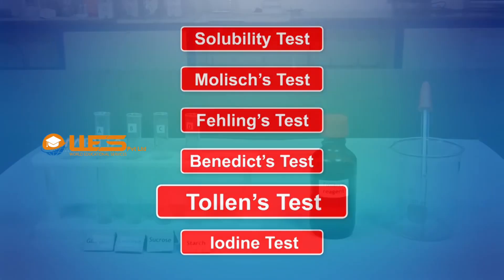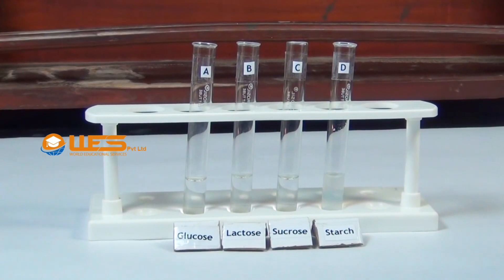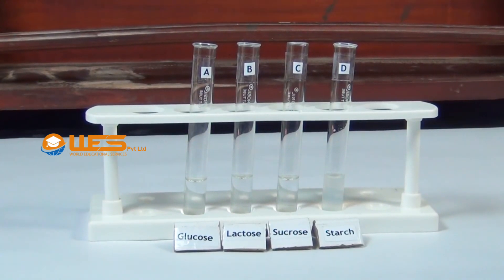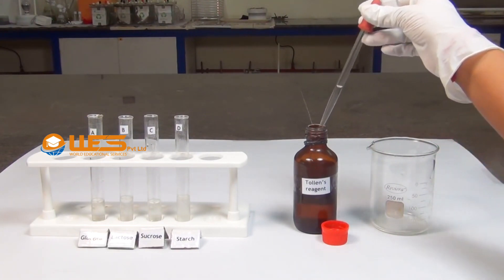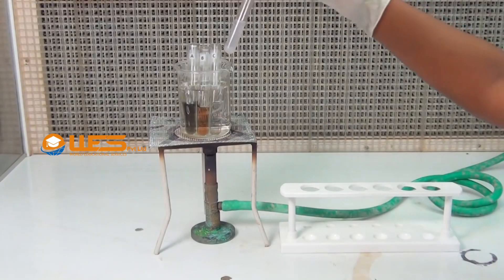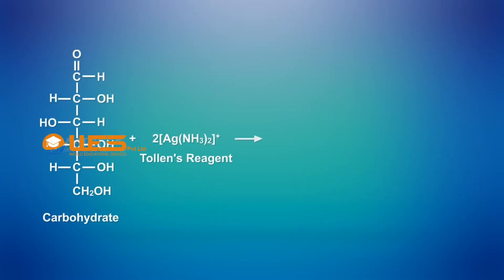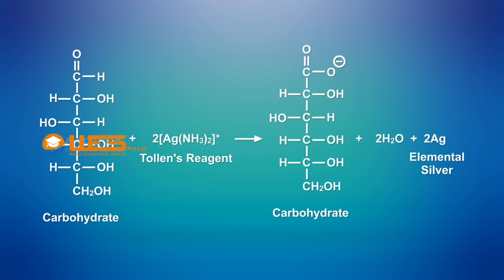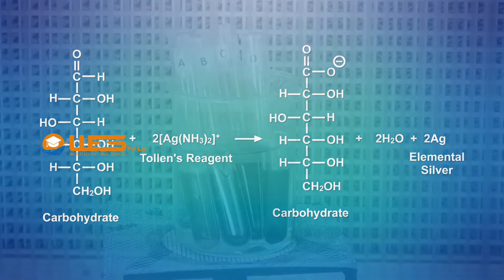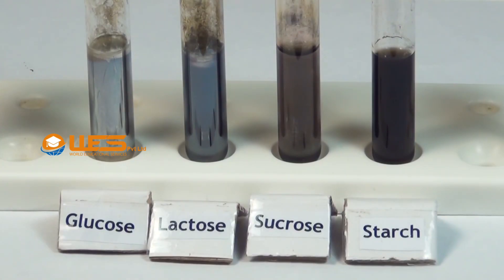Tollens Test. Take a small quantity of aqueous solution of glucose, lactose, sucrose and suspension of starch in four test tubes A, B, C and D respectively. Using a dropper, add a small quantity of Tollens reagent into each test tube. Heat the test tubes in a boiling water bath for some time. The reducing sugars, glucose and lactose, reduce silver ions in the reagent to elemental silver, appearing as a silver mirror on the inner surface of the vessel. No such silver mirror is produced by non-reducing sugars, sucrose and starch.